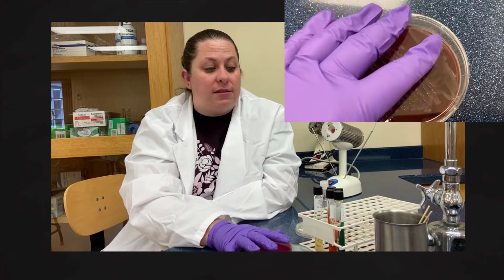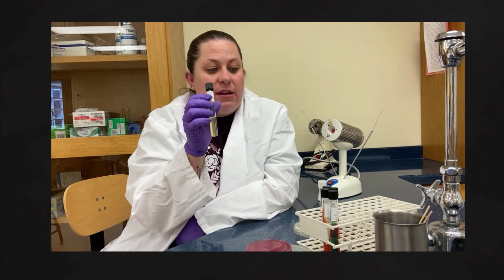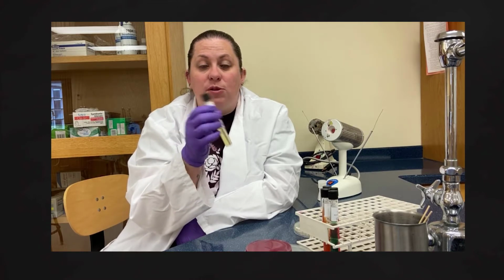All right, so we're going to use a streak method here for these. When we're talking about our broths or even our agars that are in the test tubes, these are going to be utilized in a little different way, and we're going to use either needles or an inoculating loop to inoculate them.